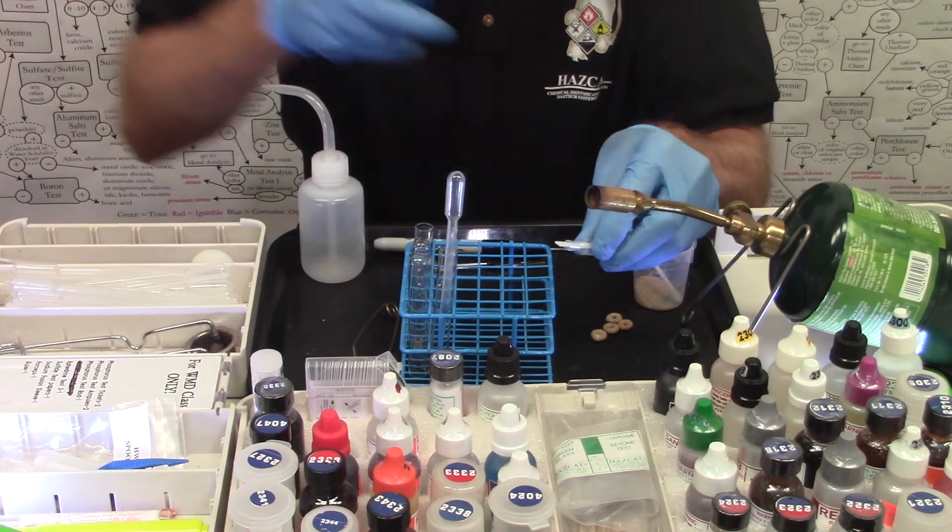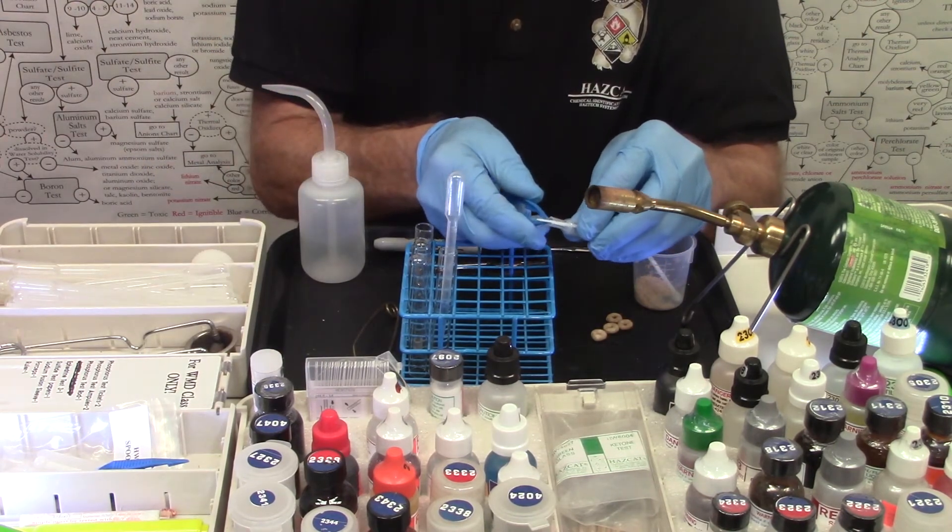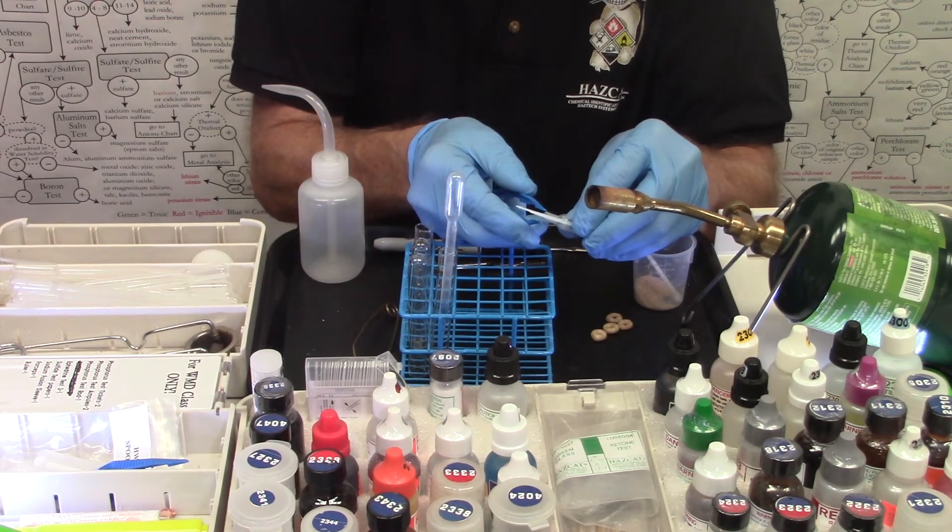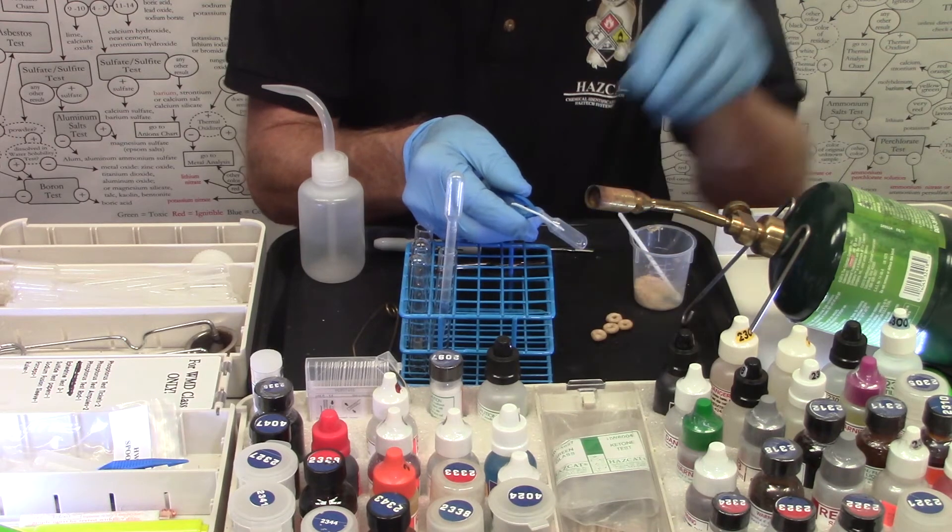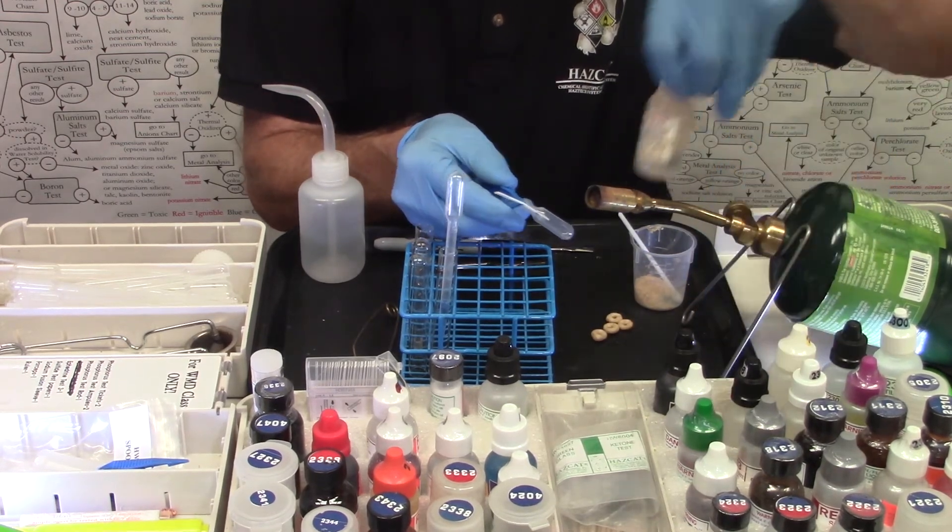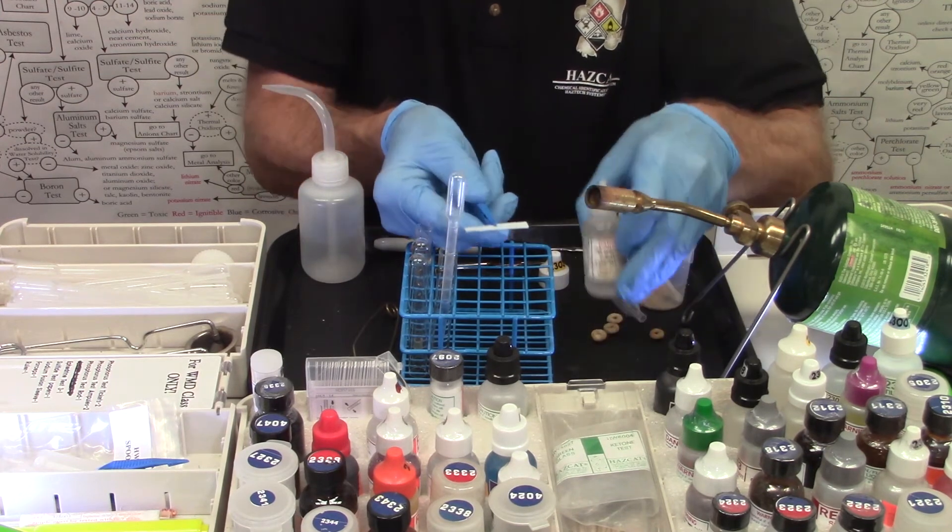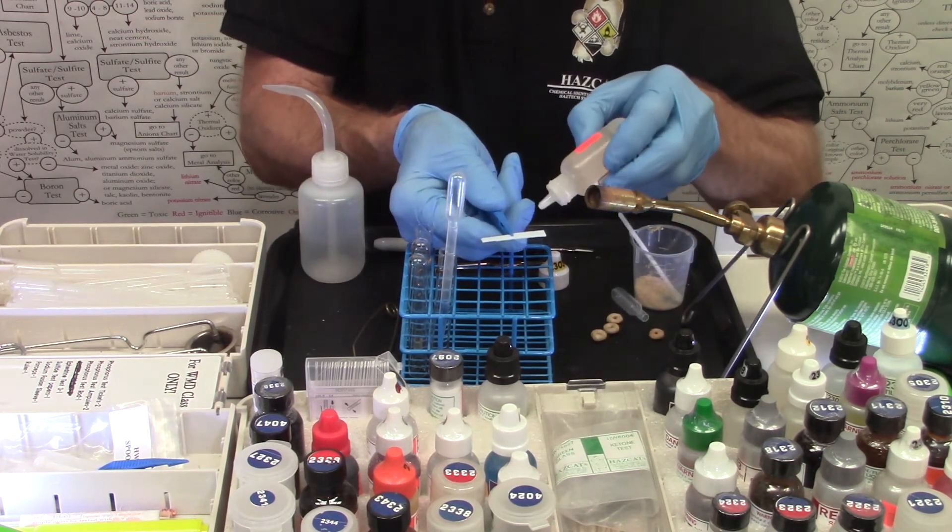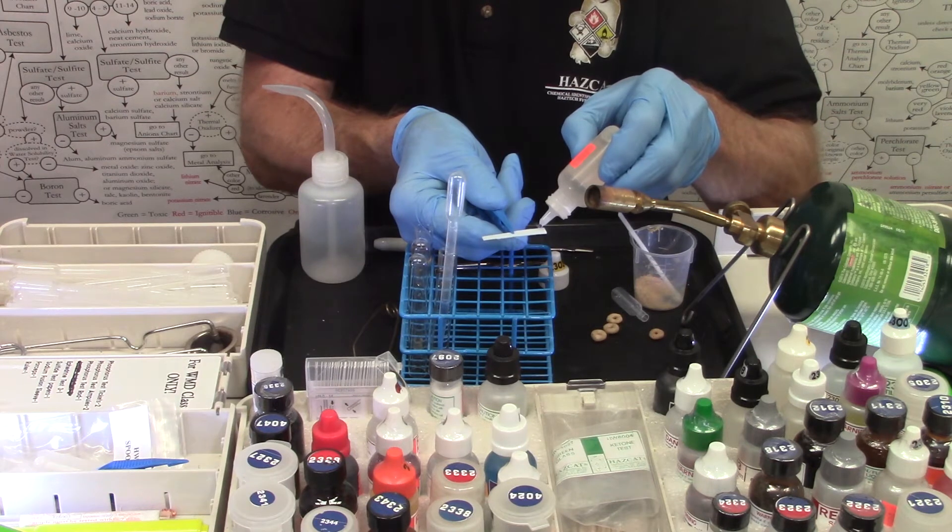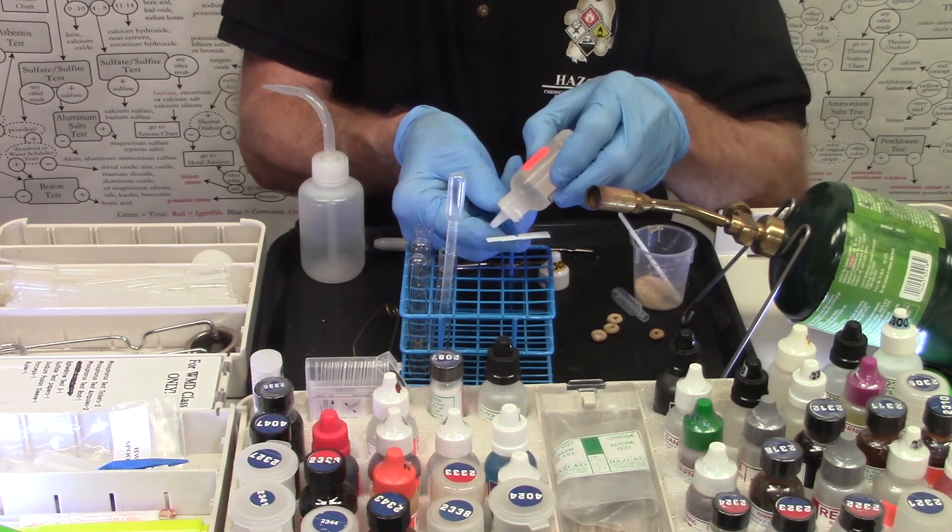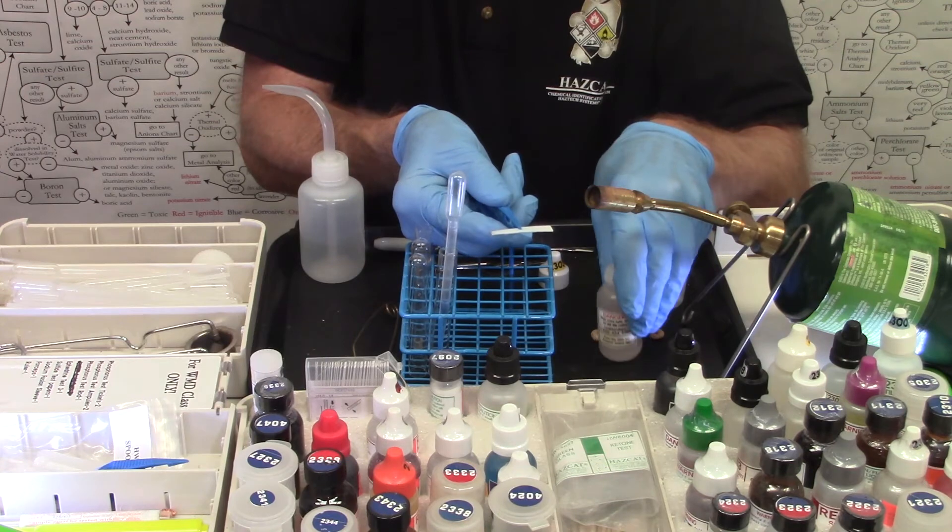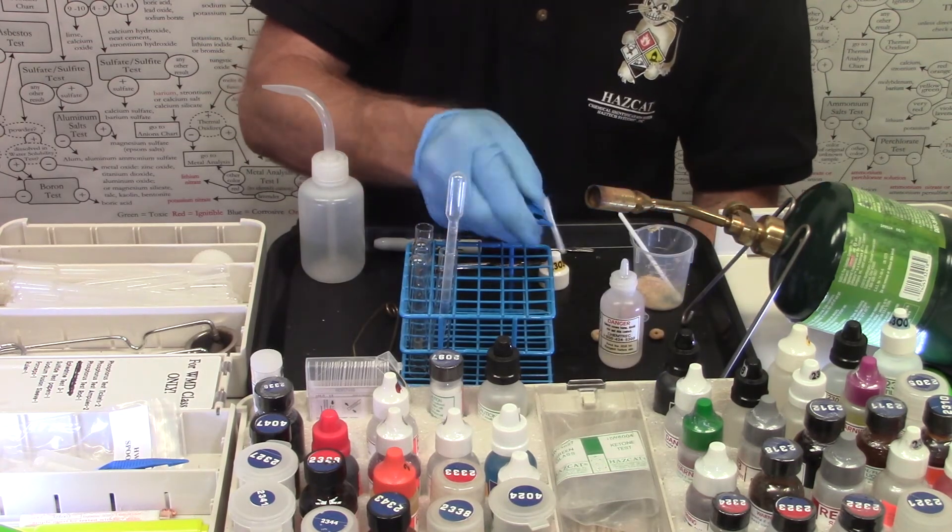And now very carefully, we're going to remove the paper using the forceps. We're going to grab it in the middle. And once we pull it out, we're going to take our 2303 and add one drop of this 2303 hydrochloric acid to each end. And we're looking for the formation of a blue color.